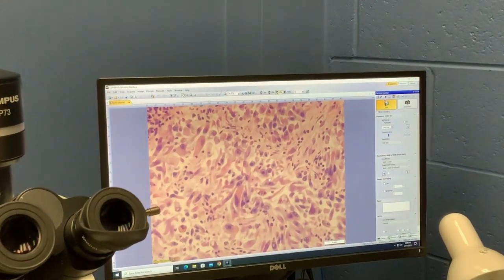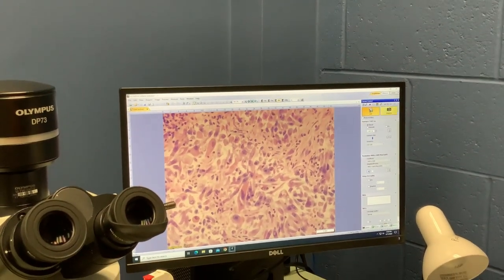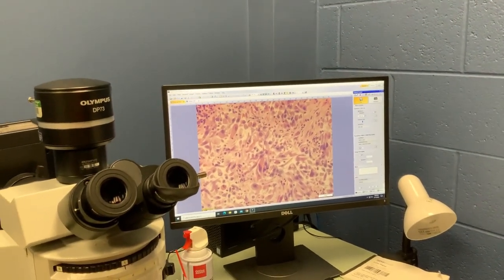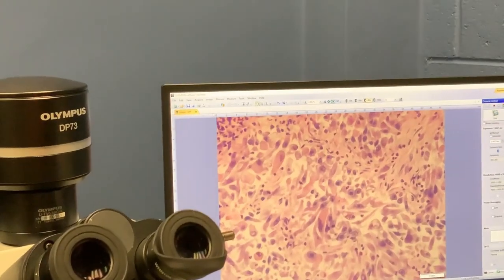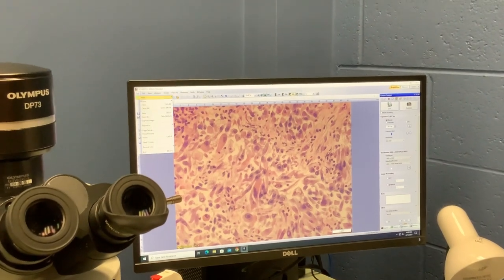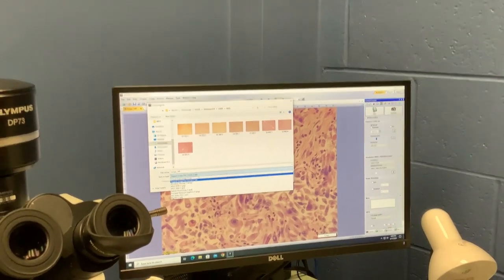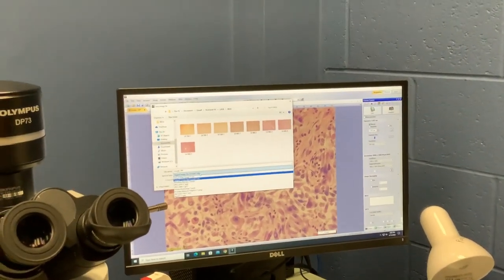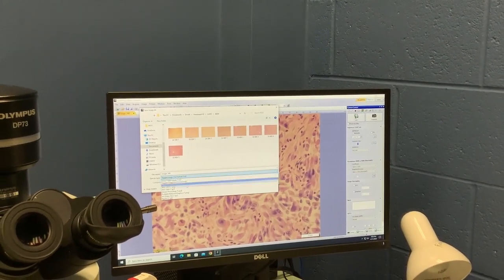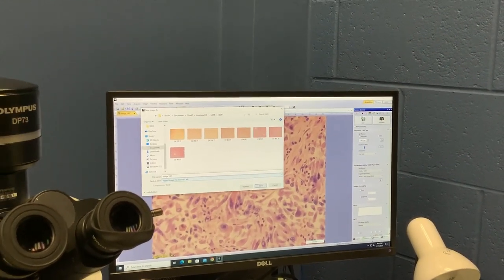We'll have to increase brightness and refocus at our new magnification. We can take a snapshot by hitting the snapshot button, and now we have our live tab, which we can freeze — this leaves us just with our image. We can save as: TIFF will be the most lossless format for taking into ImageJ; VSI is the format that will open in the CellSense software; you can also save as a JPEG or PNG if you're going to take it straight into a PowerPoint.